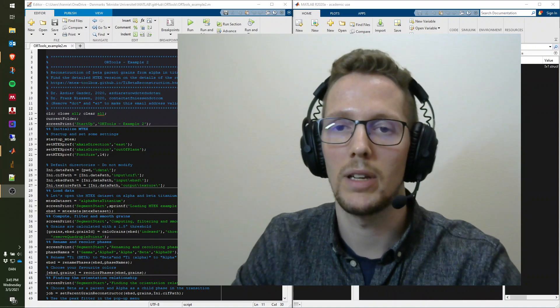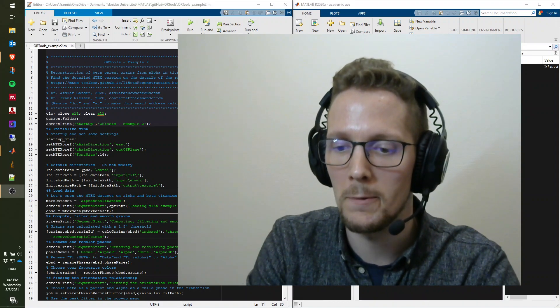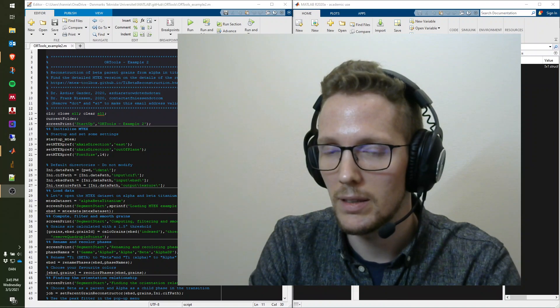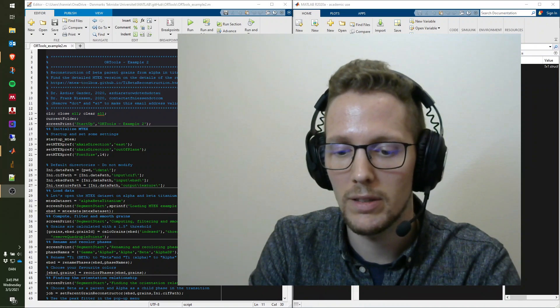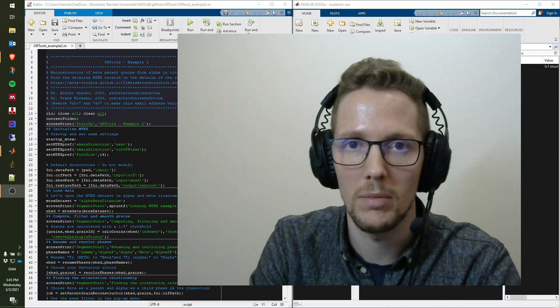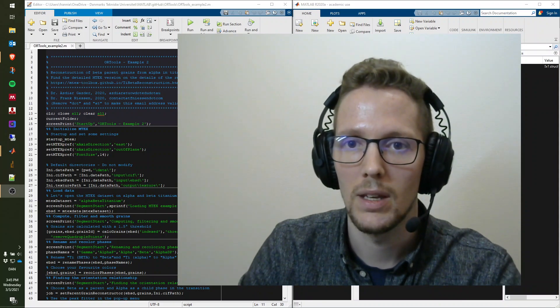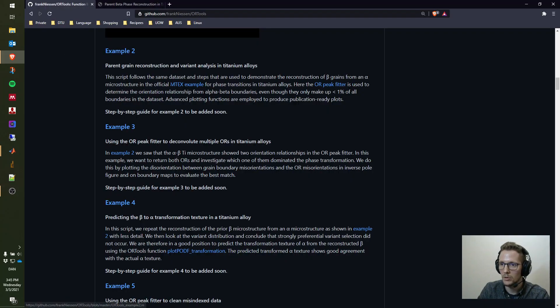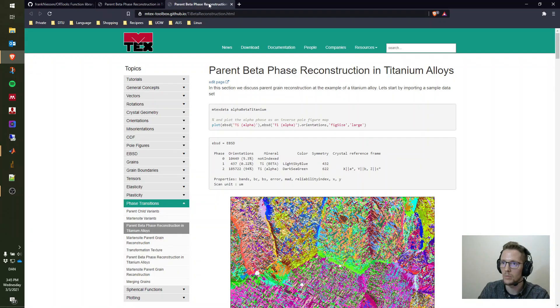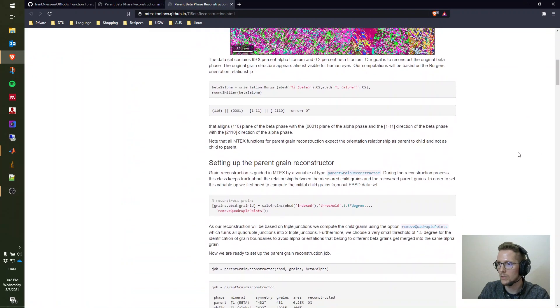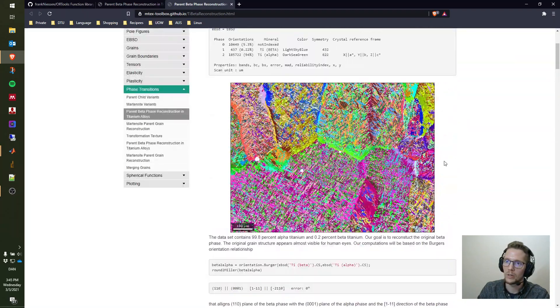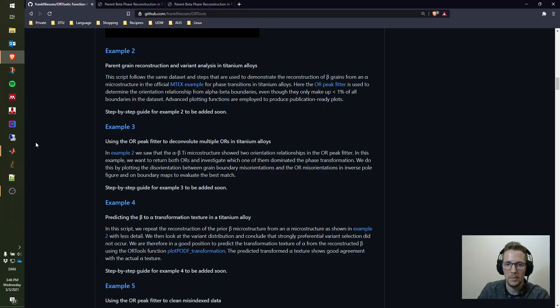After the first example, we move to the second example. In the first example we reconstructed the parent phase in a martensitic steel; this time we're going to reconstruct an alpha titanium microstructure to the parent beta phase. This example follows the official MTEX example on how to reconstruct the beta phase from alpha, and we're going to use some of the OR tools functionalities.